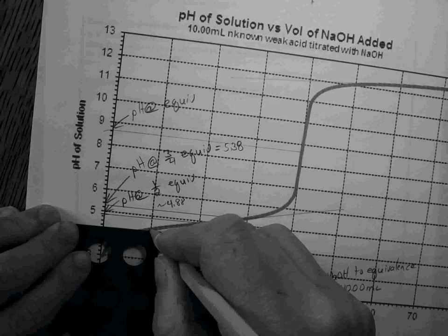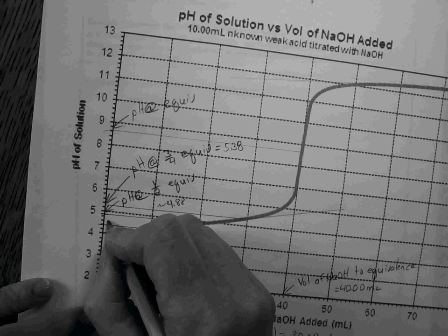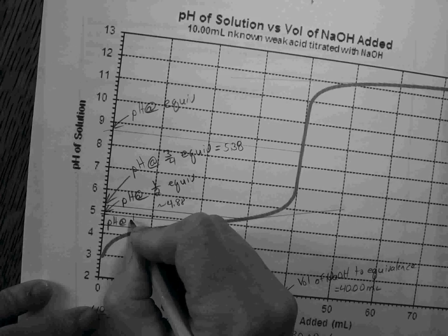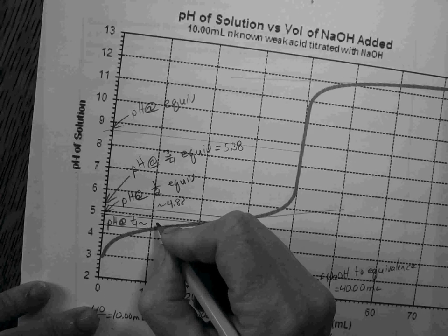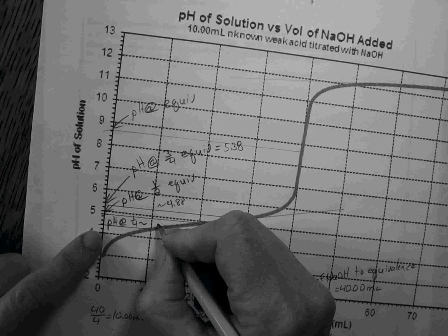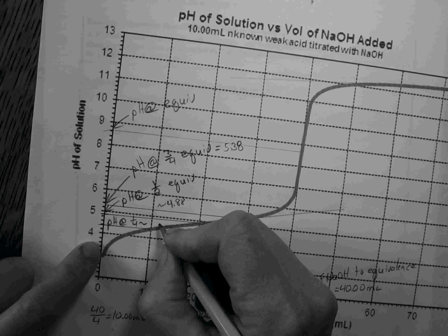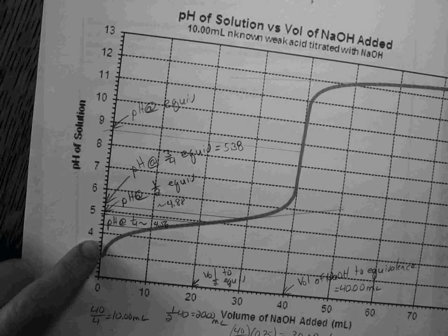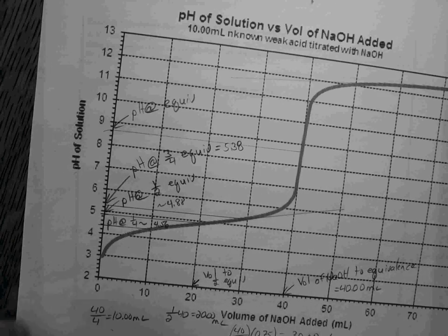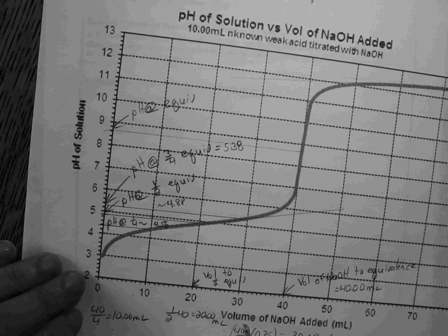You're going to have to do your best in terms of interpolating here. I'd say it's approximately 4.56. Obviously we are estimating here. All right, so we have our lines.